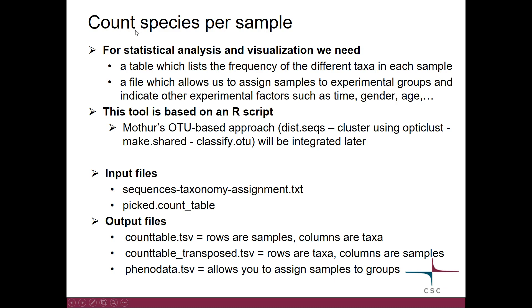The Chipster tool 'count species per sample' is based on an R script, but we are also planning to integrate Mothur's OTU-based approach, which consists of these Mothur tools, later. As input you need to give the sequences taxonomy assignment file from the previous step, and the count table.